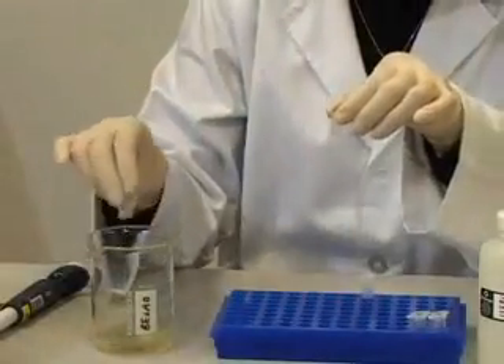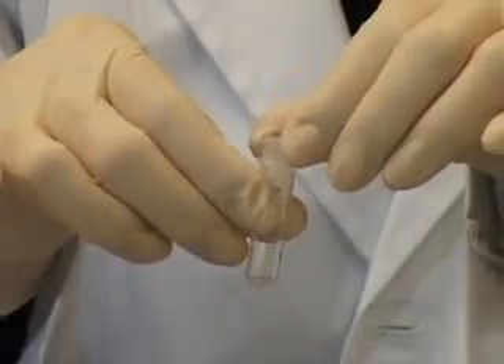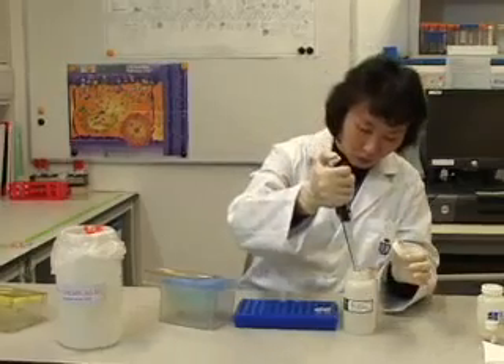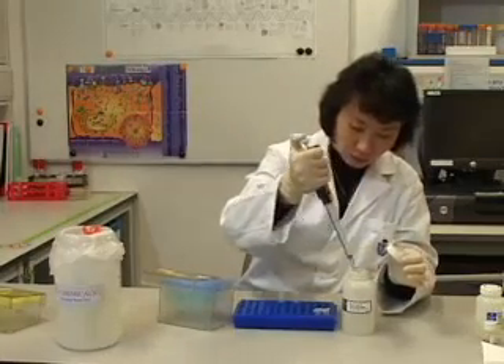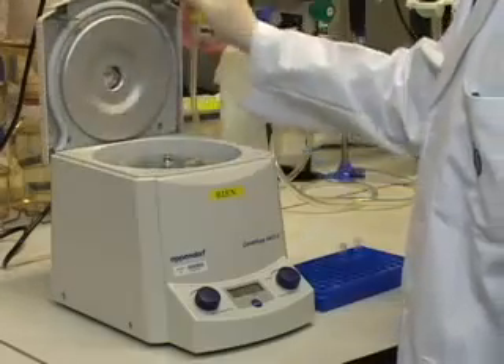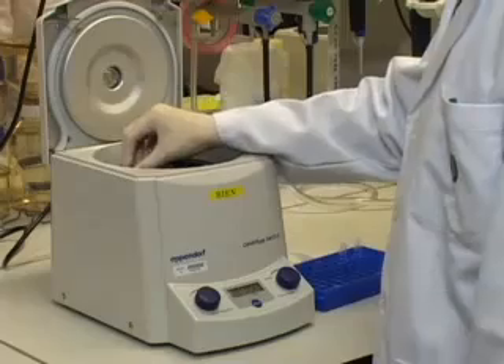Discard the flow-through and repeat the wash procedure using 250 µL of column wash solution. Centrifuge for 2 minutes to completely remove the column wash solution.